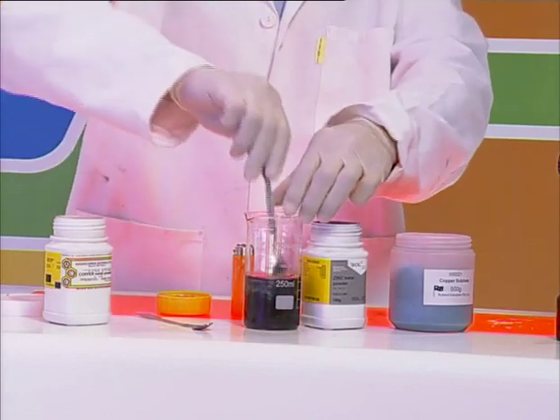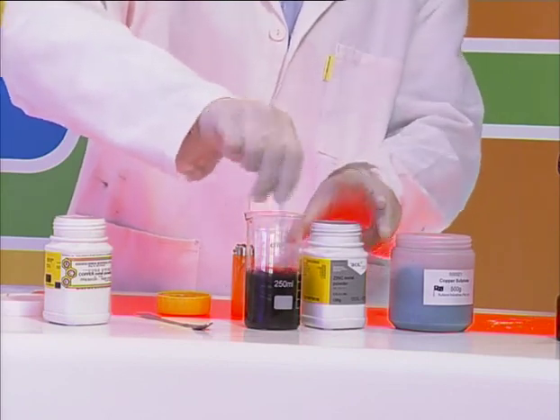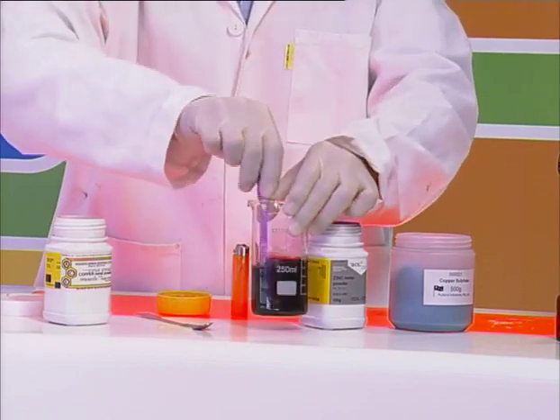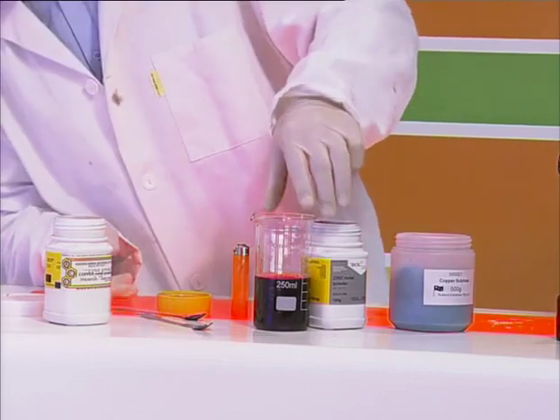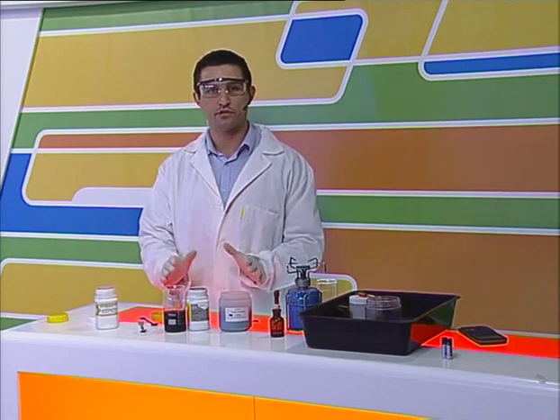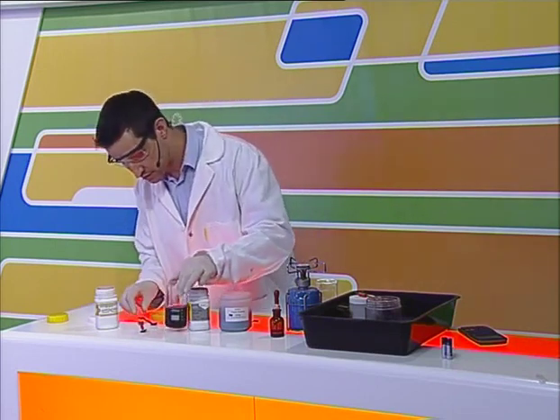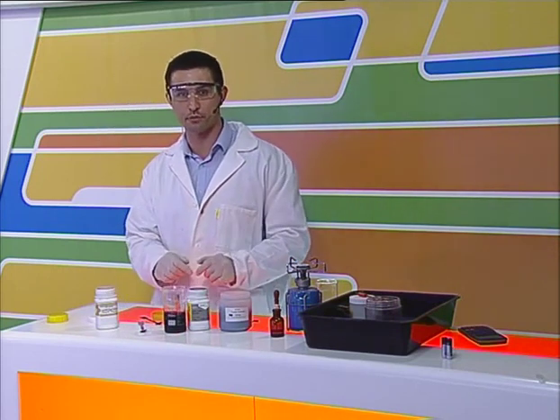Now, initially, all you see is the powder color, and I can see that it's gone nice and black over there, and that looks kind of great. But something should start happening when I allow that to settle out. We might need to leave that for a little while, but what I'll start noticing is that the zinc changes its color. I'm not sure if you can see at home, but this has started turning a little bit brownish, just like copper powder.